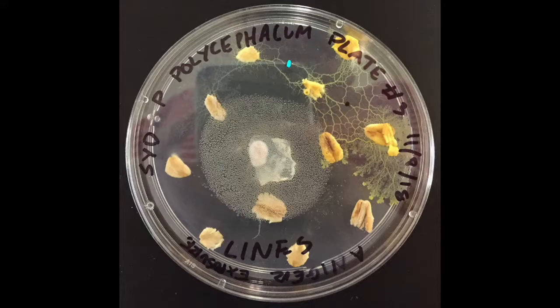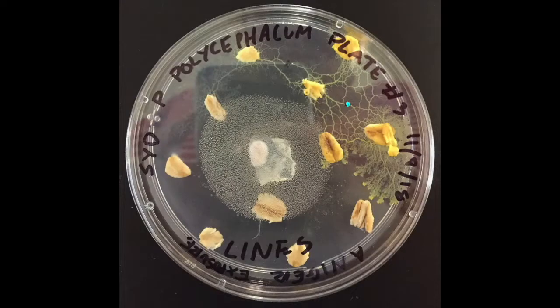Plate three — I plated the Aniger along the lines of the slime mold, not at an intersection, but just straight on a line. Here's looking at the right one, short clips, cytoplasm flowing as usual. Things looking pretty standard.